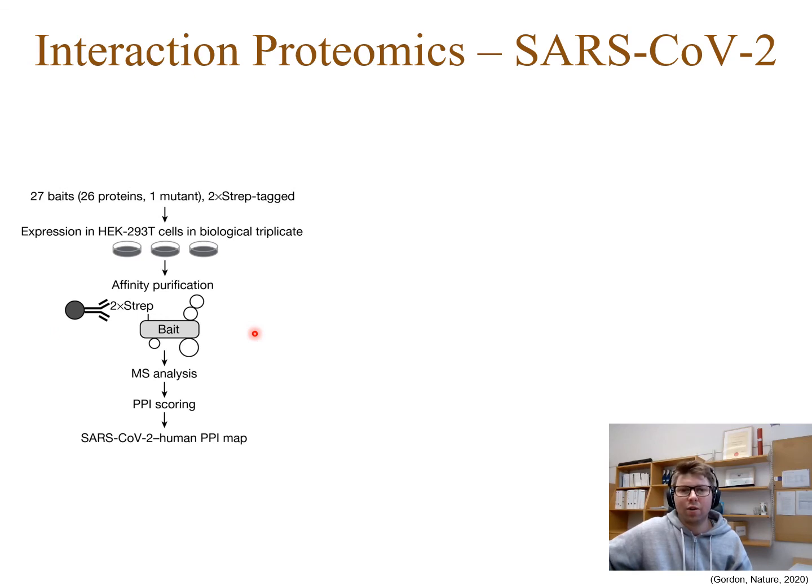And this allowed mass spectrometry-based identification, quantitation, and scoring of human proteins, and uncovering how these coronavirus proteins interact and interfere with human protein-protein interactions.